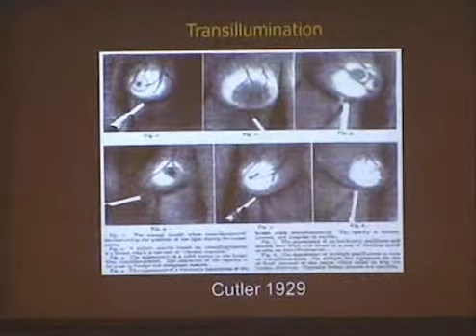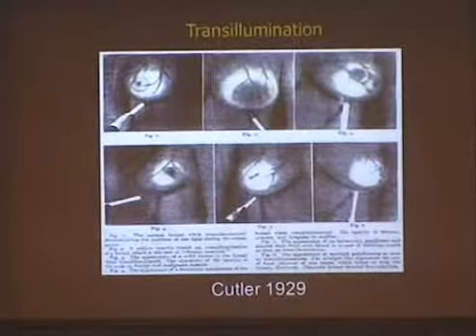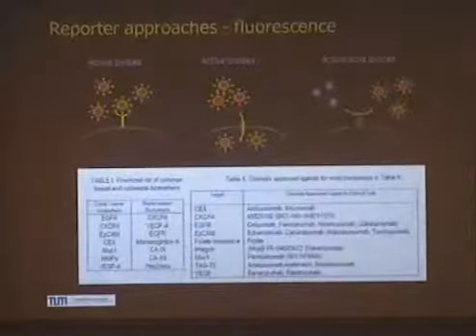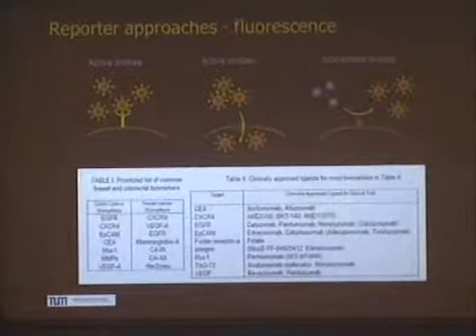And I think we had a discussion yesterday already on how we could also go deeper than microscopy with optical in order to be able to detect disease better. So the two problems are specificity on one hand, and scattering on the other. And I will discuss first the specificity.